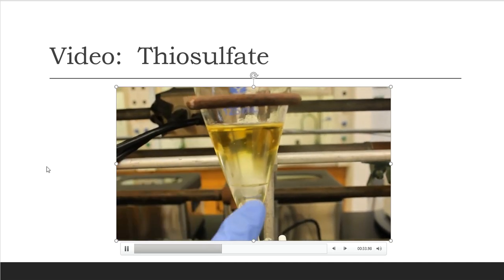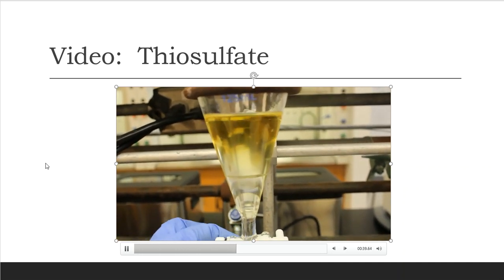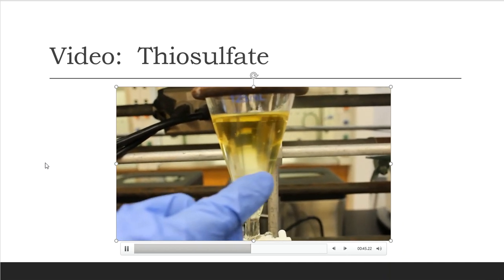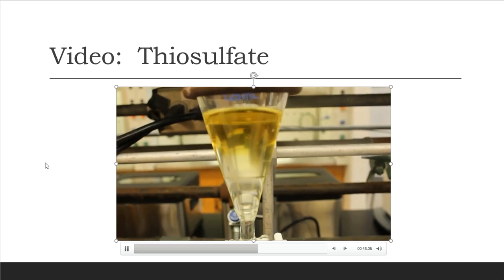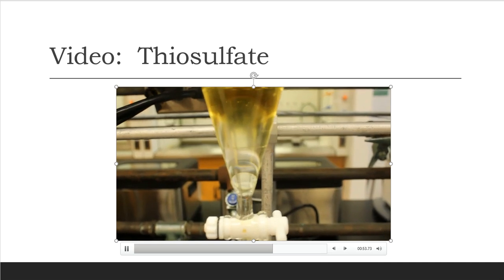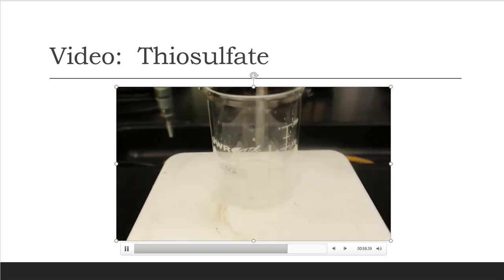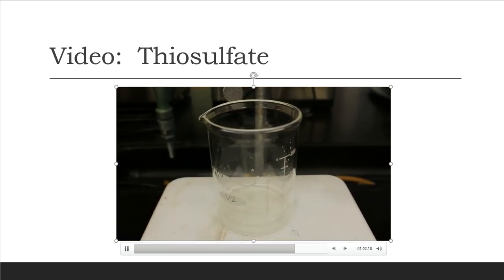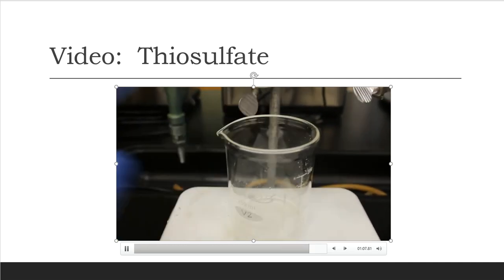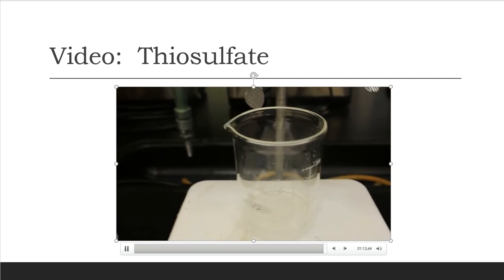And then down here at the very bottom, this is the aqueous sodium thiosulfate that I added. So I'm just allowing these 2 things to separate. I can give this a jiggle and you can see that immiscibility line that's right there, or the surface line. All right, so I'm going to let this separate just a minute or 2 more just to make sure that all the water really has fallen out of solution. And then I'm going to drain this into the beaker down below. And this is what had my aqueous water. I'm using the same beaker because that's aqueous thiosulfate that I do not need to keep. So this is a discard beaker, and anything that I drain off, including the next step, can also go into the same beaker.